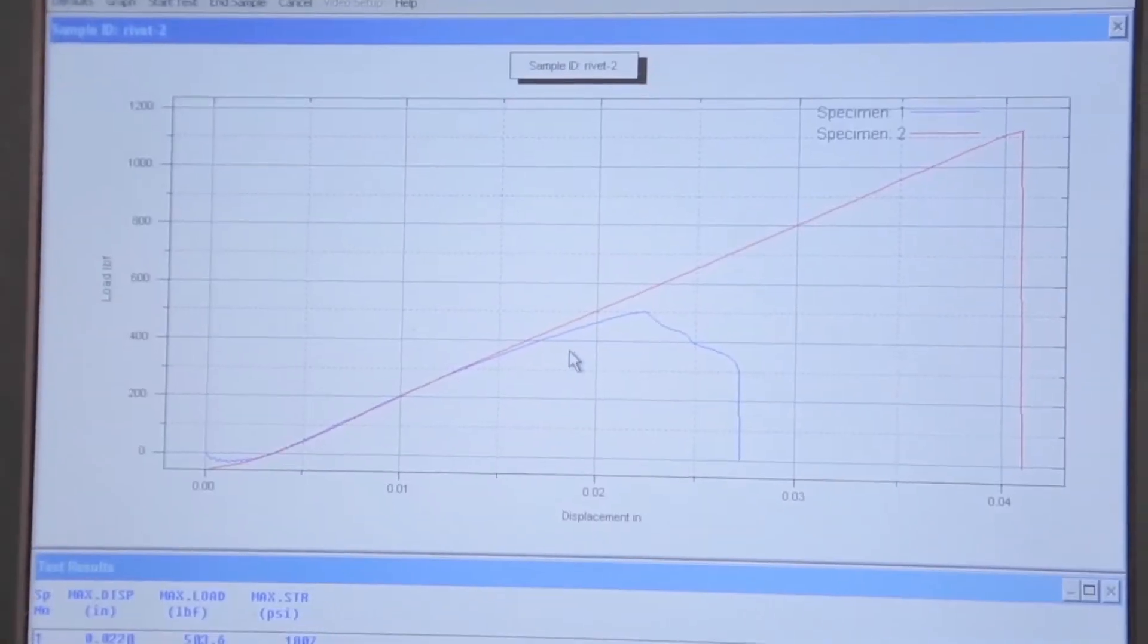We record the load at breakpoint and calculate the corresponding shear stress. This is important because if a material fails at lower strengths, it may not be suitable for some applications.